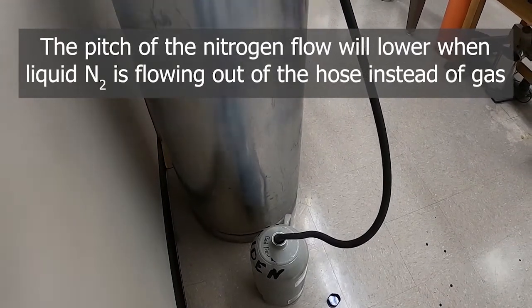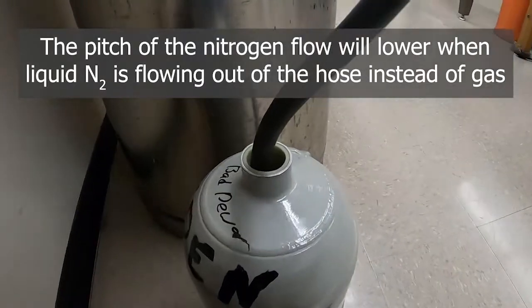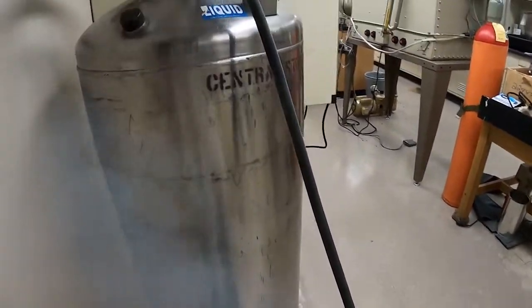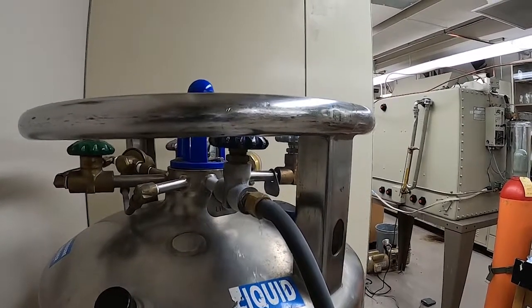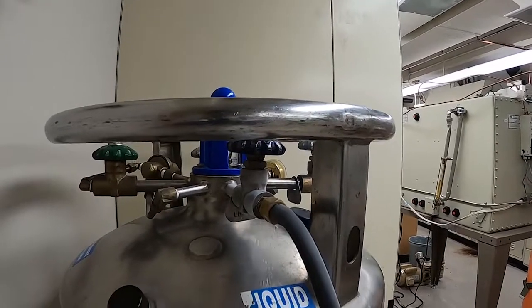And we should be filling now. We get down here closer. Sounds more like liquid instead of just gas rushing around. Yep, we're getting some splashes at the top. Also, you can see here, the gas is cold coming out through that thing that will shrink the joint and then leak out. So it's really hard to seal those joints with liquid nitrogen since they shrink so much.